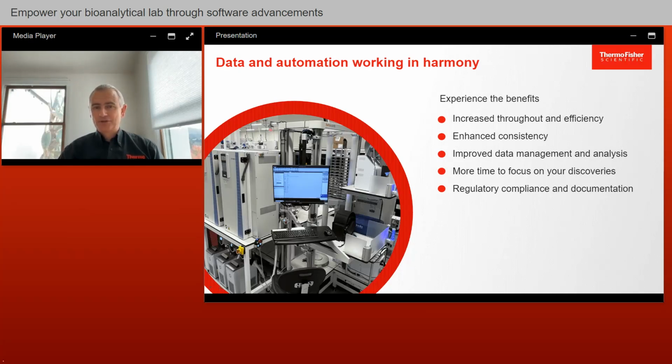And obviously there's no stress in the laboratory, but if there's any maths or stress in it, then your error rate goes up to something more like 5%. So from a data automation point of view, that's why we need to have systems of record that actually do some of that work for you and ensure that you don't drop the ball yourself, and has checks and balances to ensure that you've done the right thing.